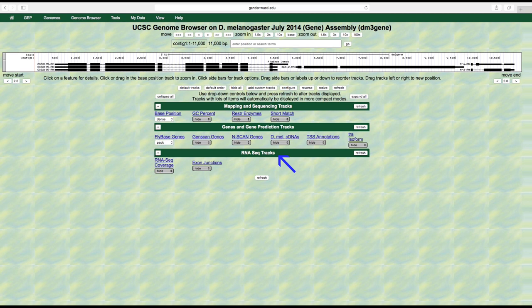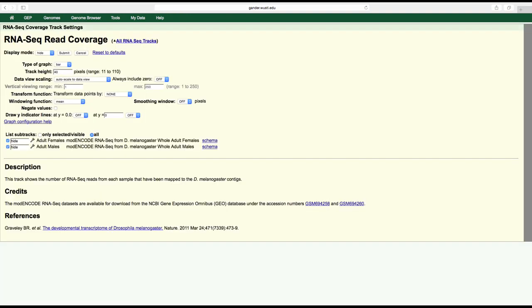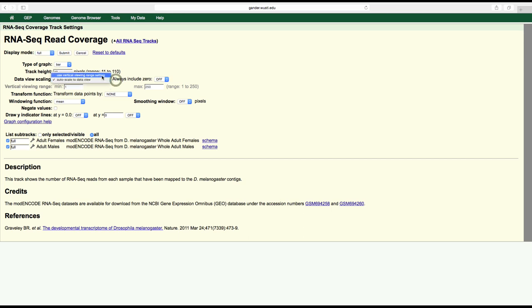To visualize the RNA-Seq read coverage data, click on the RNA-Seq coverage link under the RNA-Seq track section to open another window in order to specify the settings for this track. Change the display mode to full, change the data view scaling field to use vertical viewing range setting, and change the max field under the vertical viewing range section to 37.